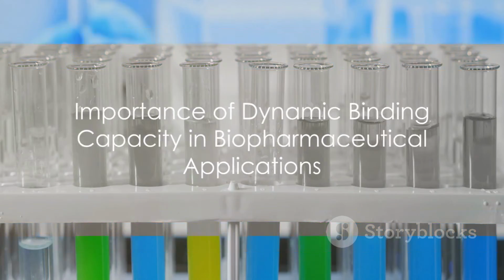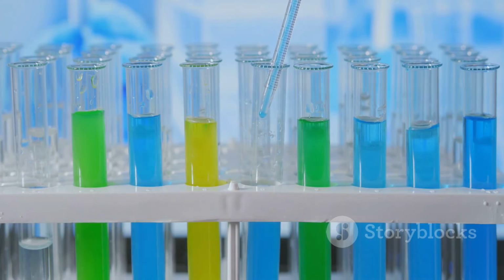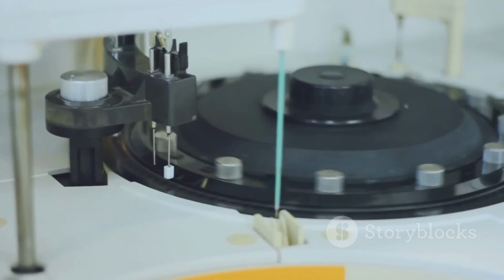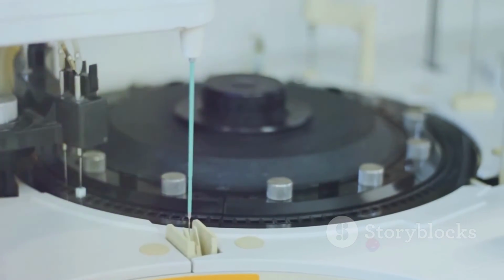DBC plays a vital role in process development and optimization in various biopharmaceutical and biotechnology applications. These include protein purification, antibody purification, vaccine production, and gene therapy. It directly impacts process efficiency, productivity, and cost-effectiveness.